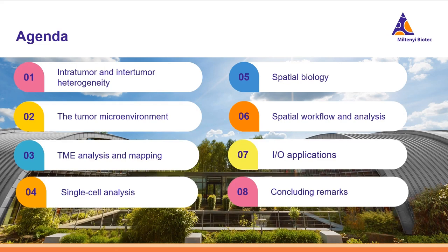This is the agenda for today's talk. First of all, I will introduce the concepts of intra and intertumor heterogeneity, which are very much related with the existence of the tumor microenvironment. I will then show you the different ways to analyze the tumor microenvironment, and these have been classified based on their dimensionality. And we will focus on single cell methods, and in particular on the sample preparation, which is required to obtain high quality samples that will give us reliable single cell data.